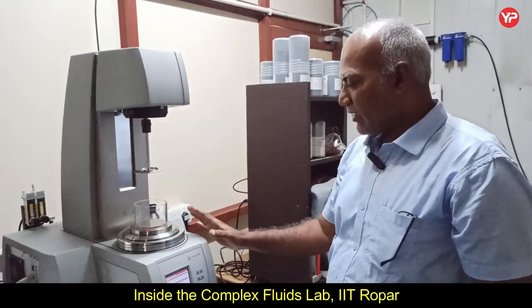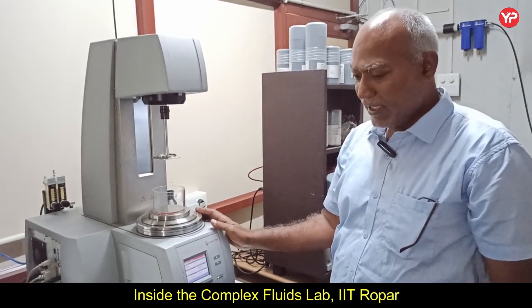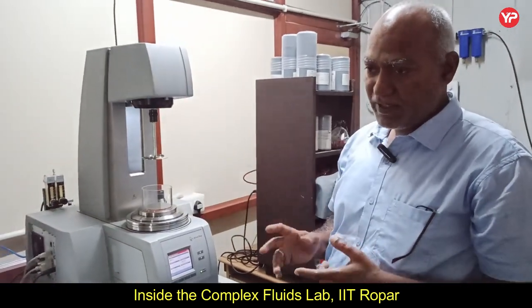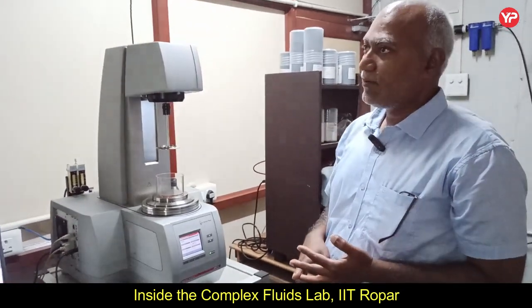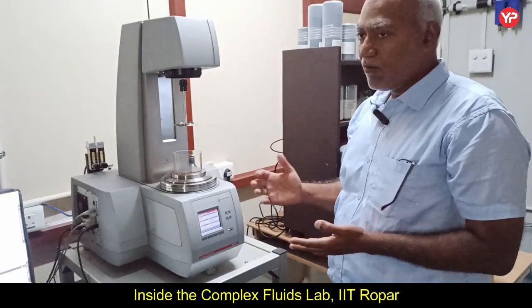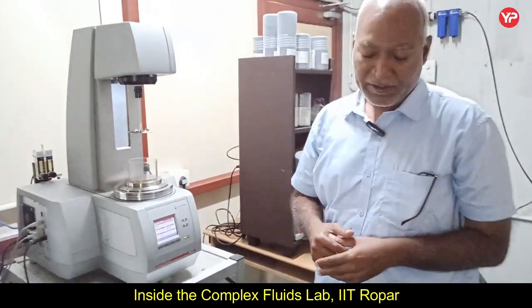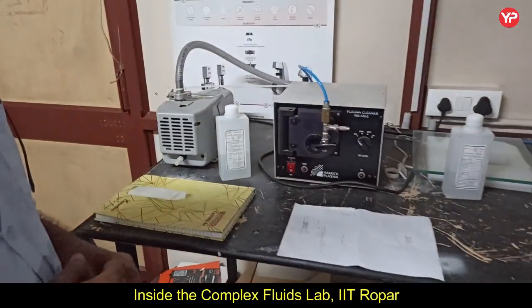Other than that, there are other modules for this rheometer. We have magnetorheology, so that we can put the complex fluids in a magnetic field or an electrical field, and we can also look at the microstructure from below while they are shearing in different fields.